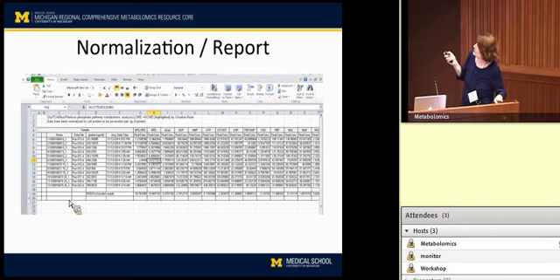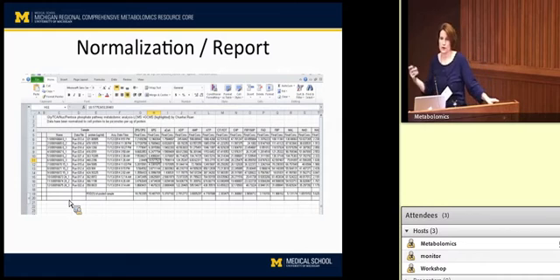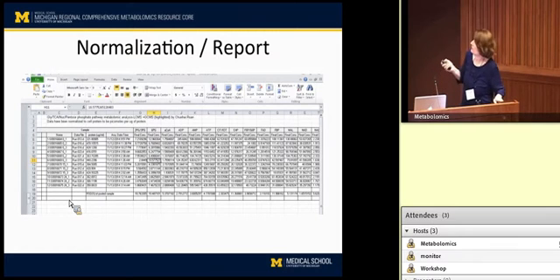But I just want to show you what a sample report looks like. What's reported is the concentration of the sample. You're told up here what the units are, and then down here, this is that RSD of the pools that I was talking about. When we run that pool sample many, many times throughout the course of your analysis, we take the relative standard deviation of all the runs for each compound and give you a measure of what the error is.